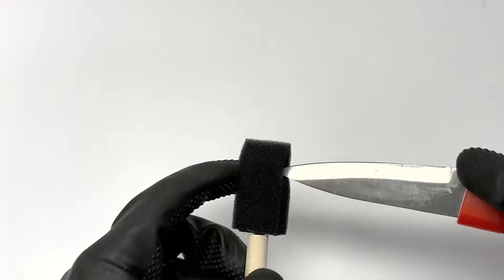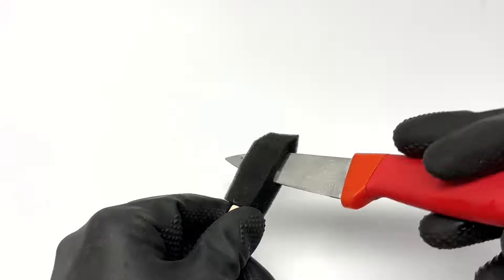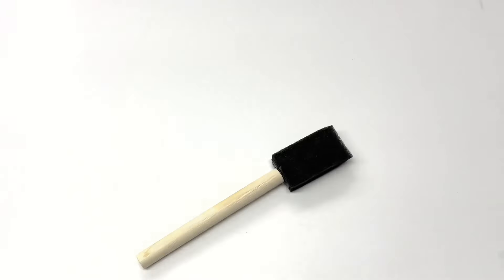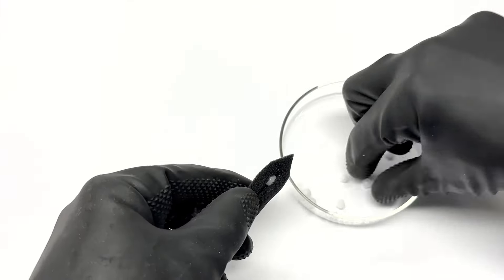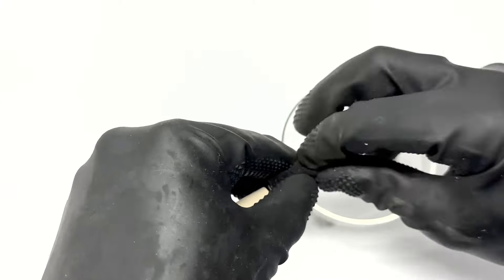To pull this off, first get a foam paintbrush and then cut a slit all the way through the foam. Next, take a bunch of solid pellets of sodium hydroxide and pack them into the slit made in the foam brush.